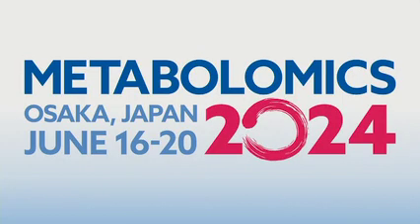We do export this. There's one format, the CSV format, where we export everything that's in the table as far as we can convert it to some string format, right? So you're not going to have the chromatographic shapes there. Yeah. But it's not all there. And if you're missing something, it's quite easy to add it. So if you're really missing something, just reach out. It's also easier as a developer to go in and grab any data that you need and then make your decisions, right?